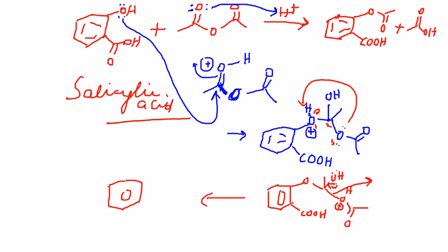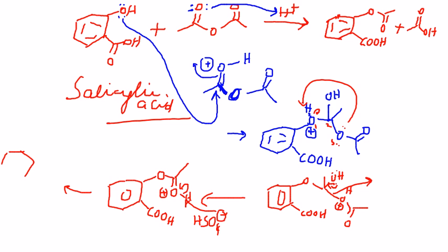the protonated ester, which is not going to be very happy right now, but you have the bisulfate which can pick up the proton, relieve the positive charge, and you're going to end up with OCOCH3 and COOH, which by the way is aspirin.